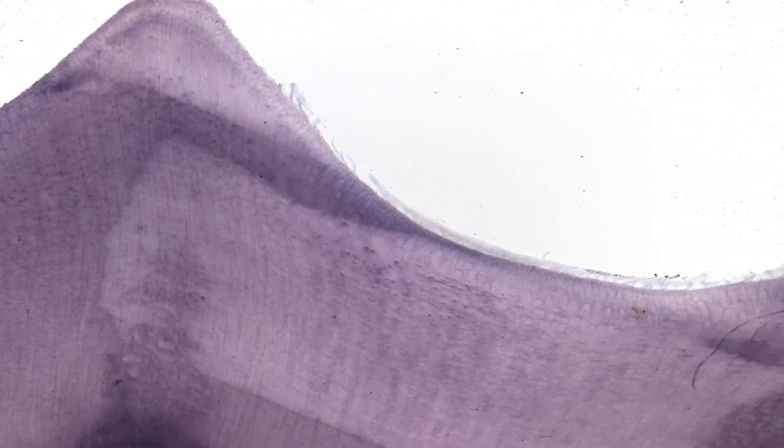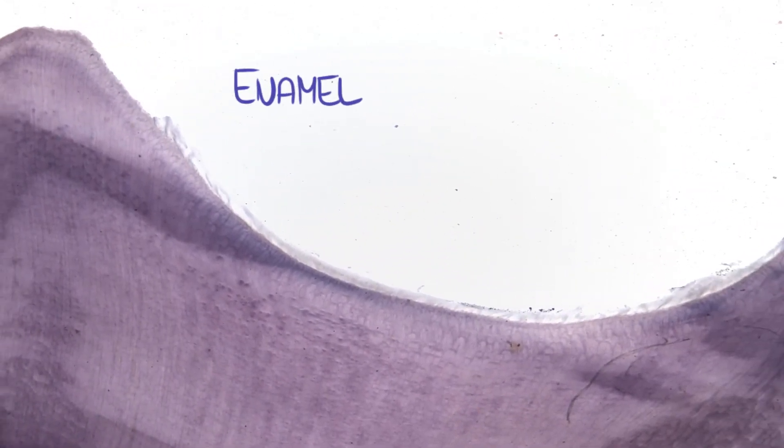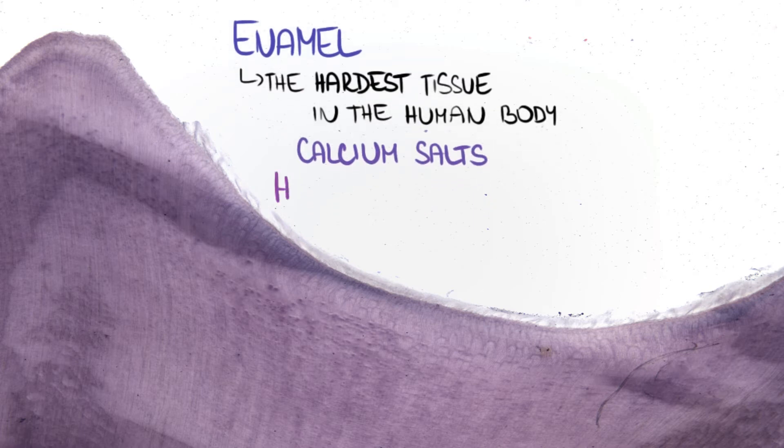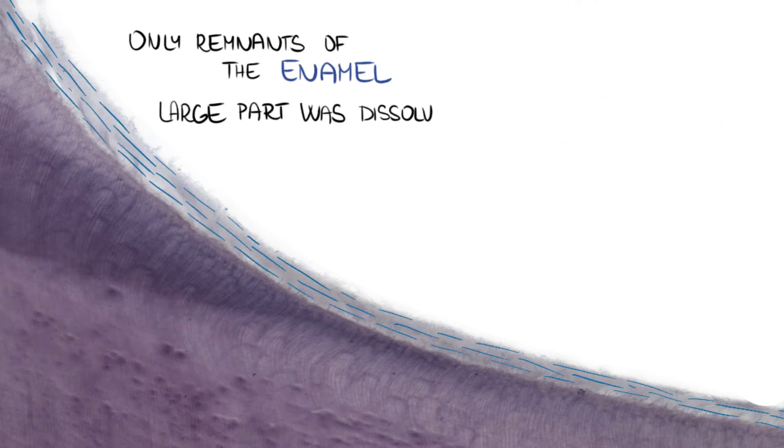Above the dentin in the region of tooth crown, there is enamel. It's the hardest tissue in the human body and consists mostly of calcium salts, especially hydroxyapatite. In the picture you can only see remnants of enamel because a large part of it was dissolved during the preparation of the slide.